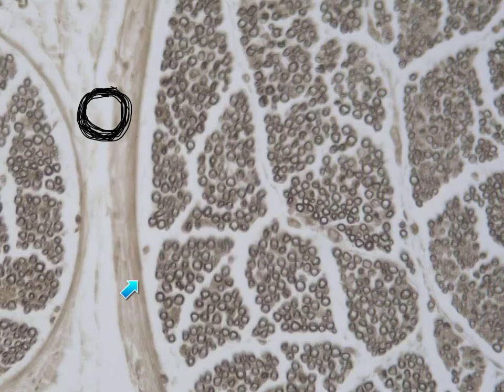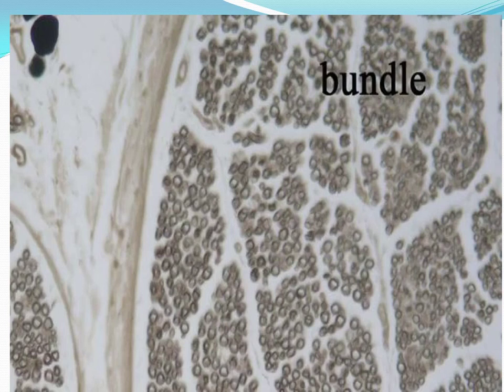Also this is the perineurium, containing a barrier against any injurious material that may damage the nerve fibers. The same picture but more magnified, demonstrating the perineurium, the endoneurium, the nerve fibers stained black, demonstrating the myelin sheath, and the white area inside demonstrates the unstained axon, because the osmic acid will stain only the myelin sheath because it contains fat.